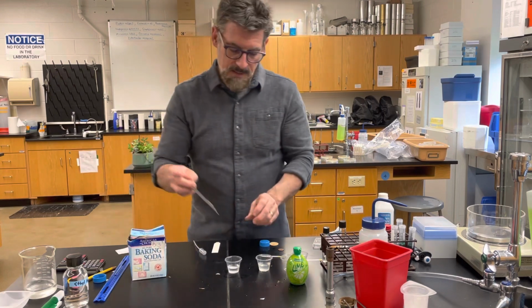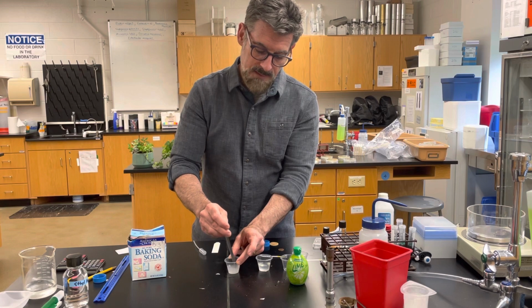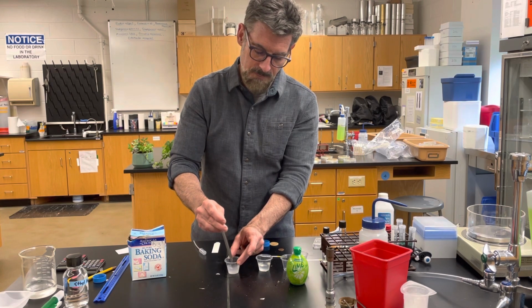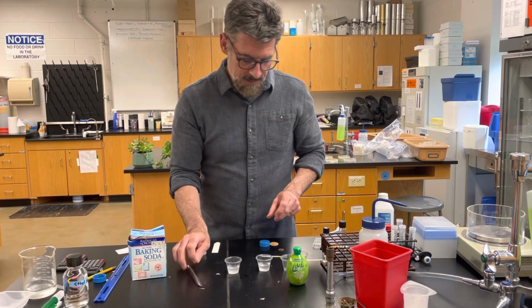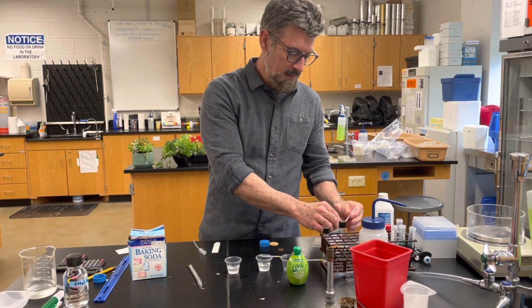If you don't, just kind of estimate something less than a teaspoon, less than half of a teaspoon. So I'm saying about a 1/4 teaspoon. So we're mixing that up there, and now we're going to get our pH test strips and see what effect each of them had.